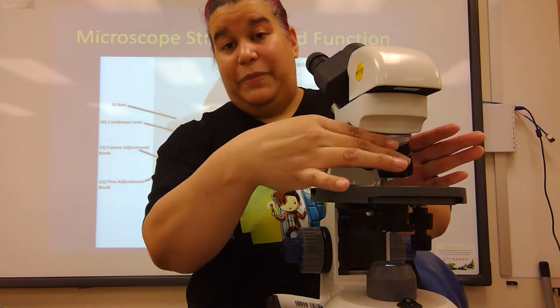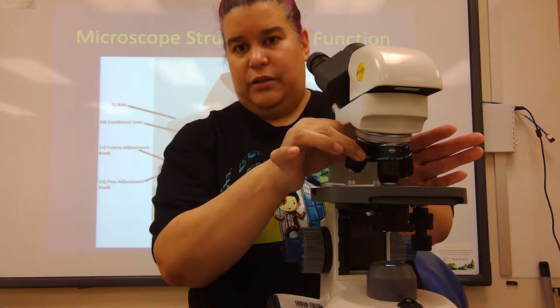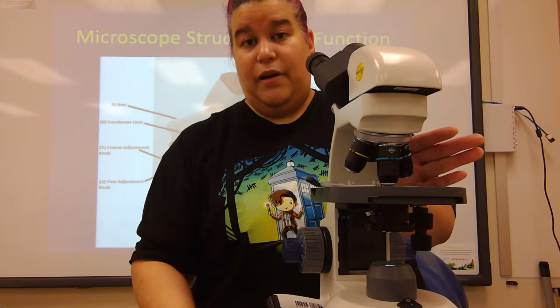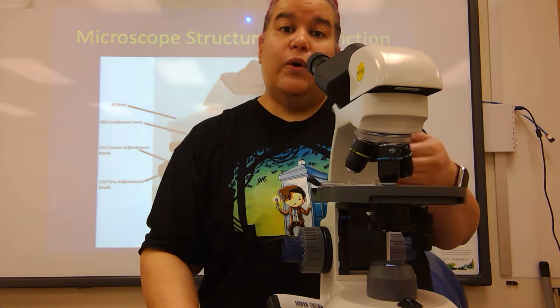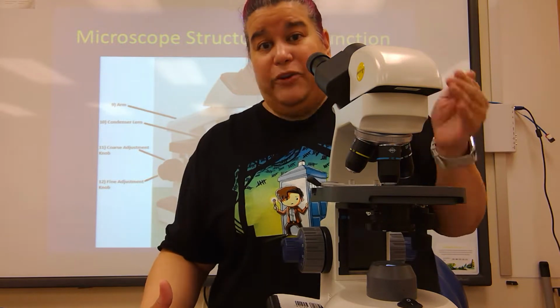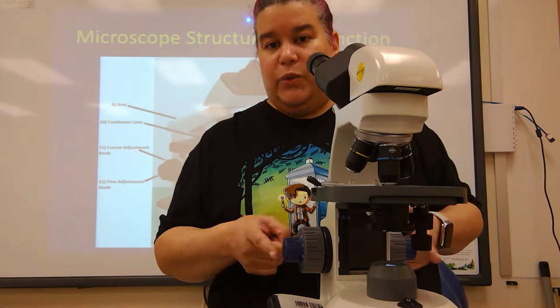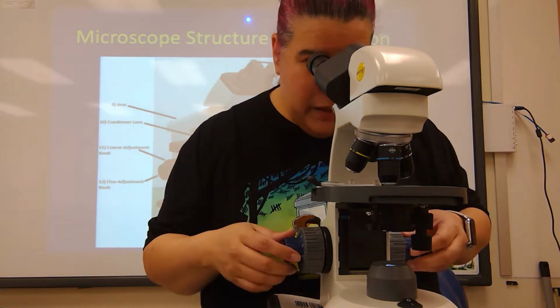Now, I'm going to go up again to 40x. See the distance? Watch. That is right on top of my slide. So I can't use that coarse adjustment because if I move it even 2 millimeters, I'm going to ram through the slide. So I use my fine adjustment knob again.